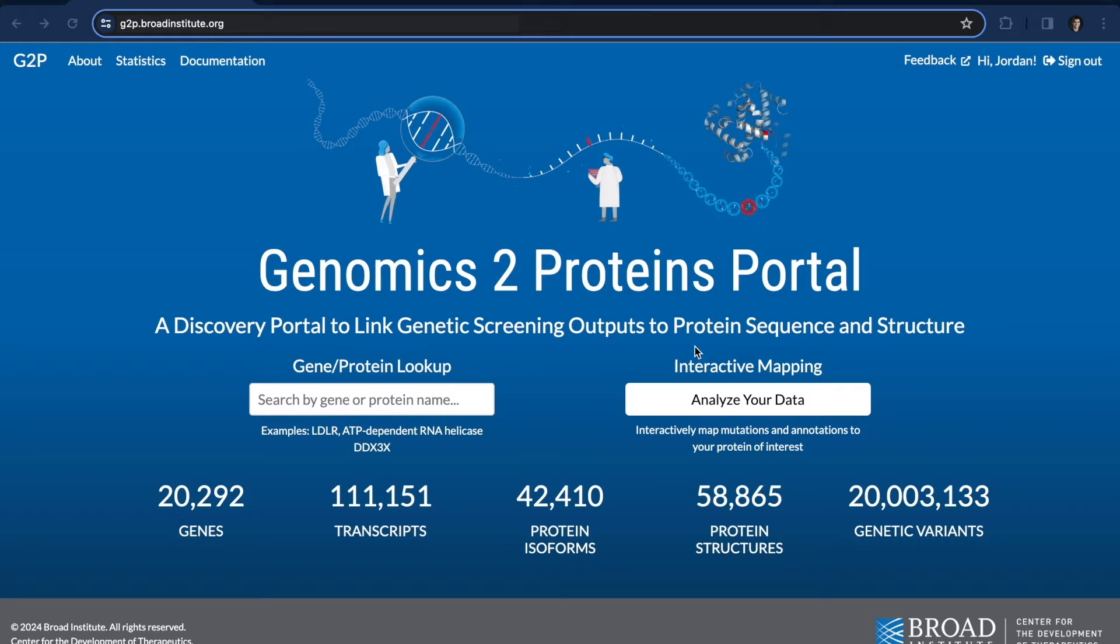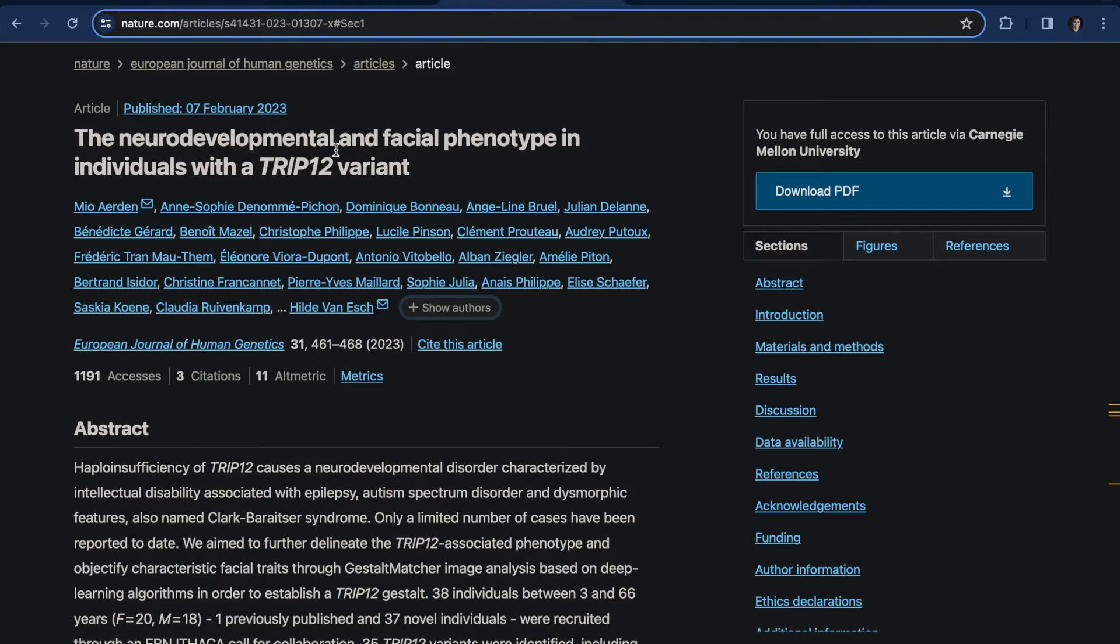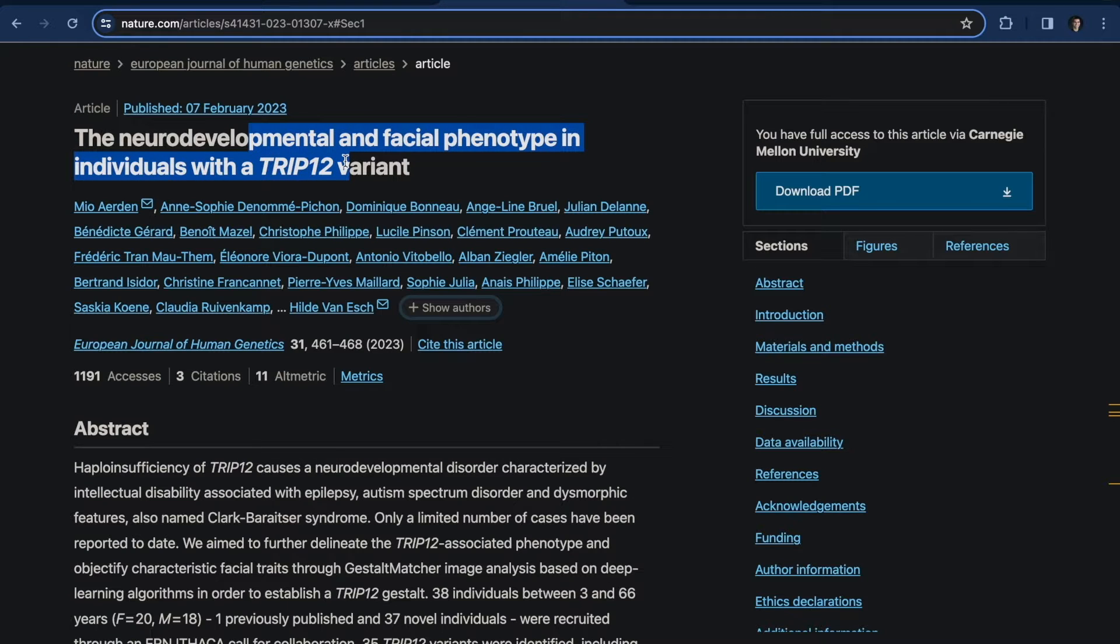So first off, we're going to use the interactive mapping tool, and we'll look into Clark-Baraitser syndrome, which is a rare inherited neurodevelopmental disorder.